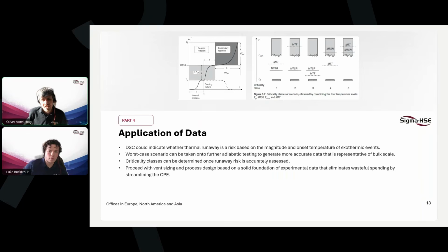However, DSC, as we've discussed, really is fantastic for early stage assessments of new materials or processes, again, due to the small sample size requirement and cost effectiveness.